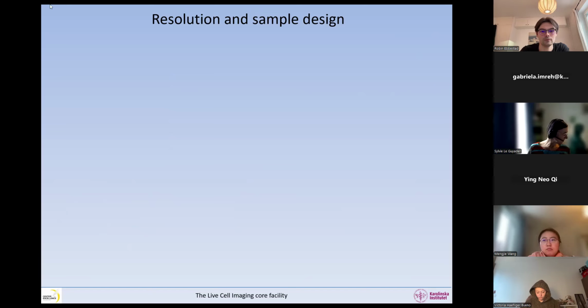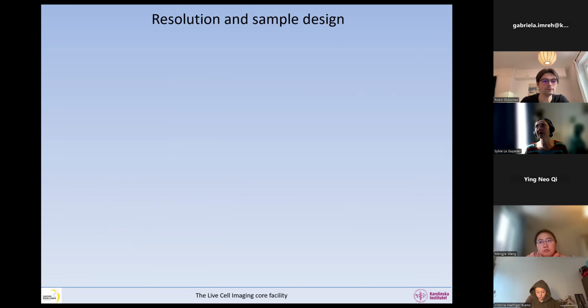Yeah, that's an excellent question. And different microscope manufacturers have made different decisions for this. It used to be the case that you would have different pinholes, one pinhole per detector. But this was abandoned a long time ago because it was making it very difficult to compare the different images. So now there is one pinhole on a single point confocal, one size of pinhole. On a multi-point confocal, we have also one size of pinhole. We have thousands of pinholes, but they're all the same size.